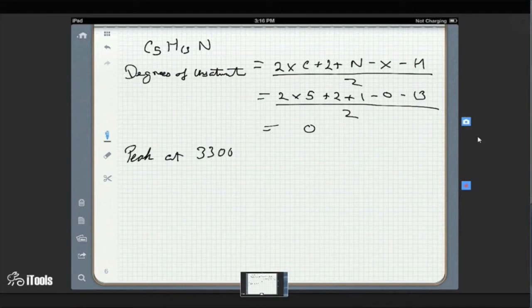If we had an amide, we'd see a carbonyl stretch, or some kind of stretch in the 1600 range. Can you go to the table? We also know there's no unsaturation. Here, amine, amide, NH. Okay, so we have NH there.